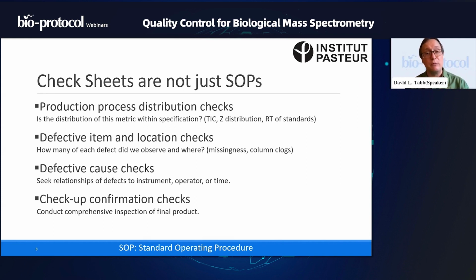One of the chief problems that we run into, though, is that sometimes the software tries to integrate a peptide in an experiment where it was not observed. As a result, we have a missing value. We have an intensity for this peptide in all the experiments where it was identified, but in this experiment where it was not, we have no intensity. So that gives us a missing value, and the more missingness you see for a peptide, the harder it is to do any sort of meaningful statistics with it. So we might consider those missing values as defects of a sort.